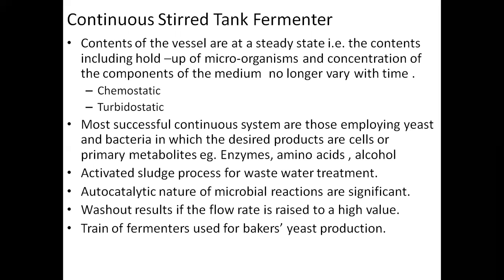There's a concept of washout which results if we increase the flow rate to a very high value. So to deal with that washout condition, there is an inoculation of fresh microbial cells along with the substrate from time to time.